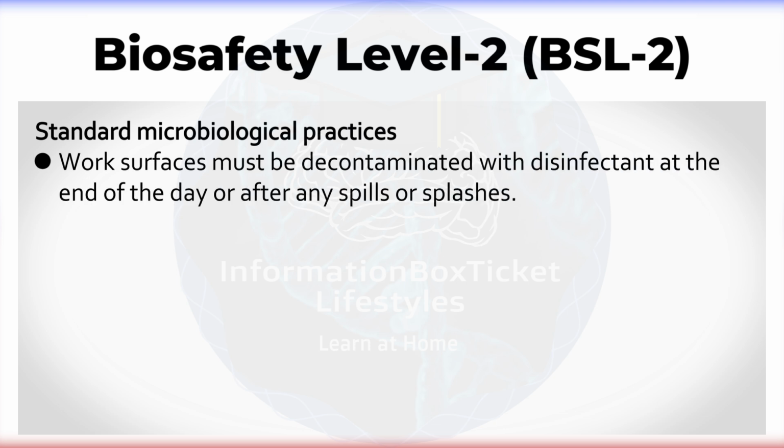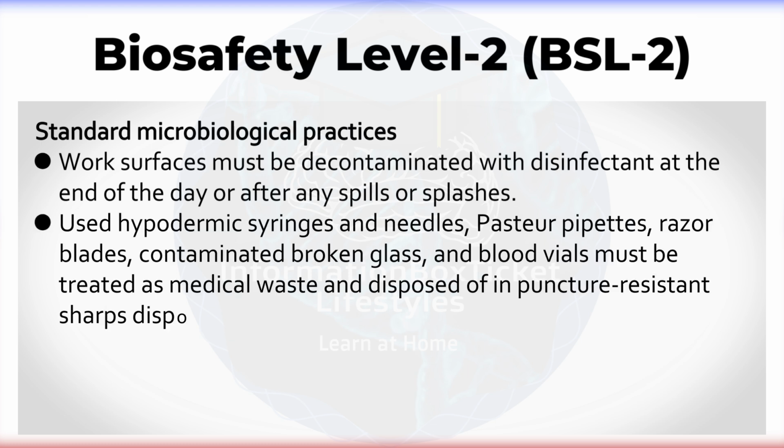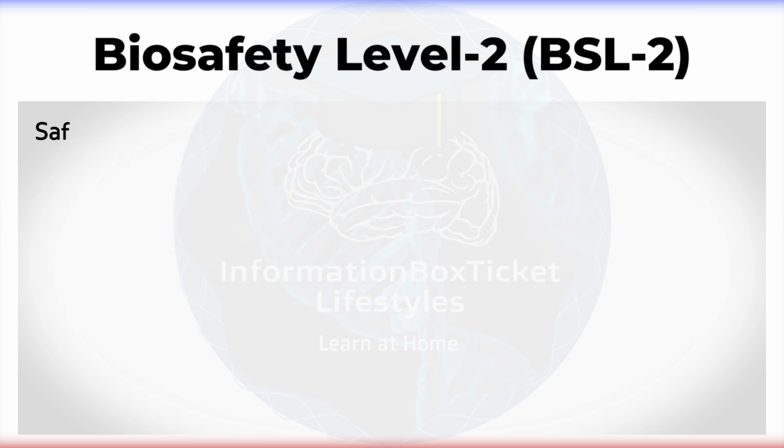Work surfaces must be decontaminated with disinfectant at the end of the day or after any spills or splashes. Used hypodermic syringes and needles, Pasteur pipettes, razor blades, contaminated broken glass, and blood vials must be treated as medical waste and disposed of in puncture-resistant sharps disposal containers.